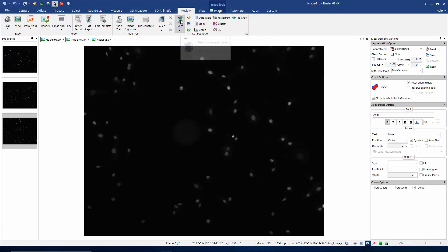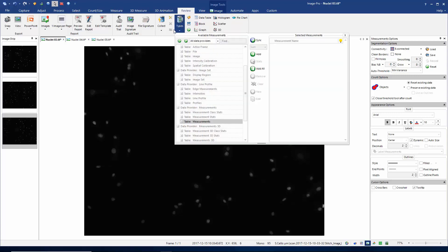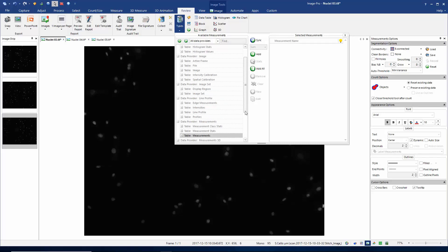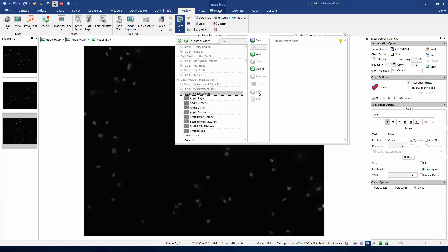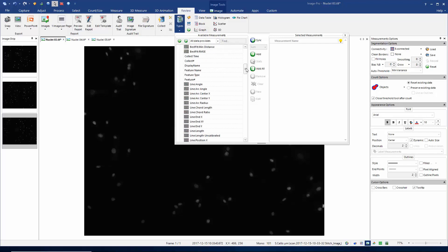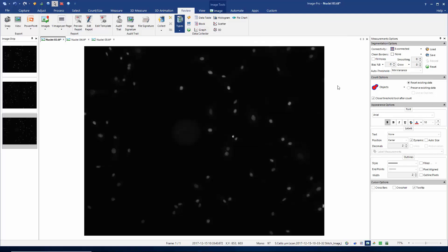Let's first think about the types of data. If I look here in this table we can see all the different sources — all the different data providers that we can use with the data collector. I'm particularly interested in using measurements, so I could scroll through this list and find the measurements that I want to collect, but there's an easier way of setting up the data collector.